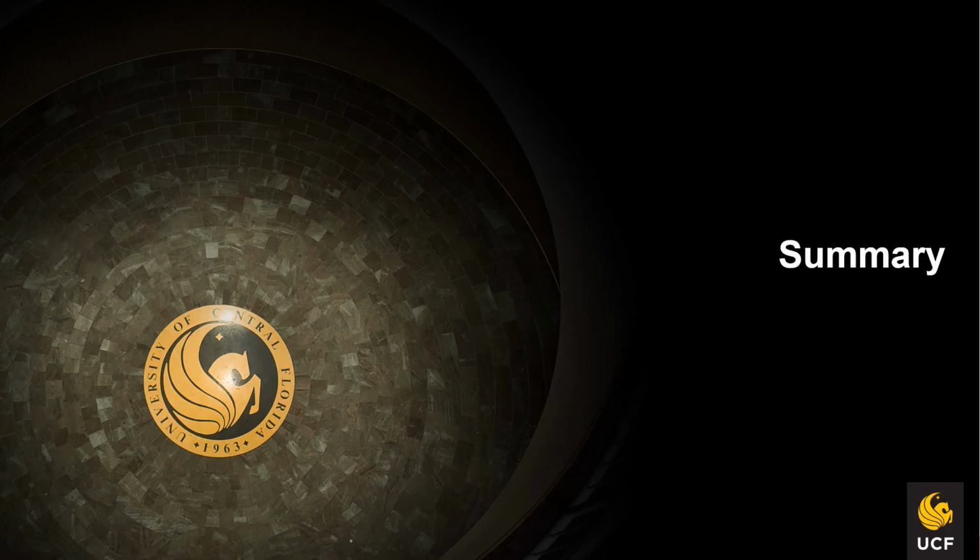So in summary, two potential ignitable liquids, which were both light petroleum distillates, were compared to the fire debris sample. There weren't any comparable LPD/aromatic reference ignitable liquids in the database to compare to the fire debris sample.